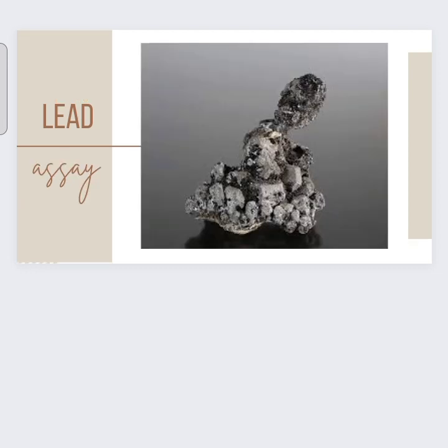Lead assay. The most commonly used reference methods for determining the blood lead concentration are electrothermal atomic absorption spectrometry and inductively coupled plasma mass spectrometry.